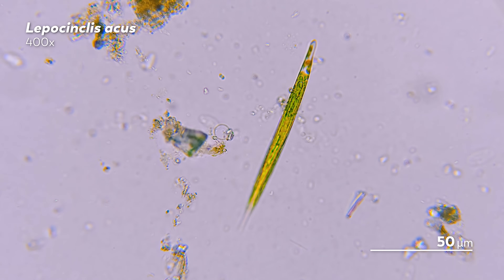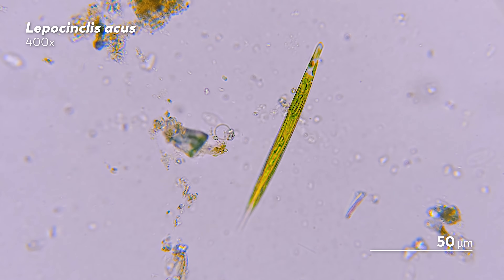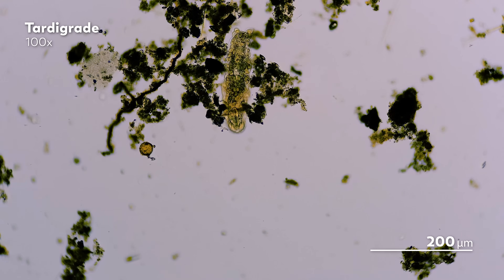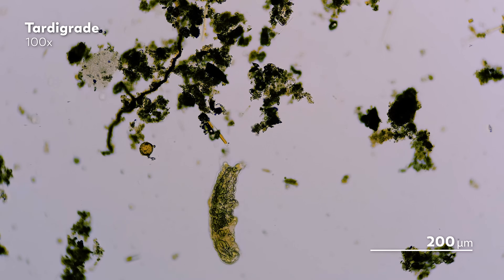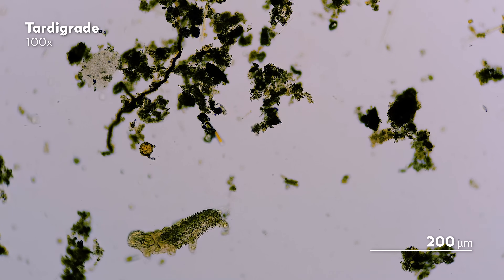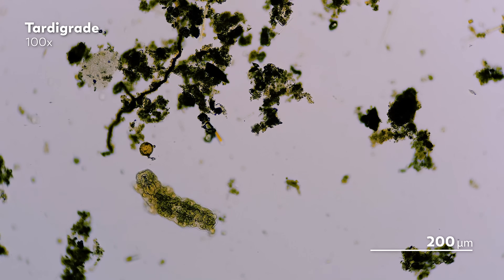We are going to focus on bright field microscopy, which means we'll be looking at samples that are illuminated entirely by white light. This is the most straightforward technique in microscopy, so it's a great place to start. But just because it's simple does not mean it isn't powerful. The intensity of the light can render many of our organisms transparent, giving us a view of the structures inside their bodies, like the cells floating around in our tardigrade here.